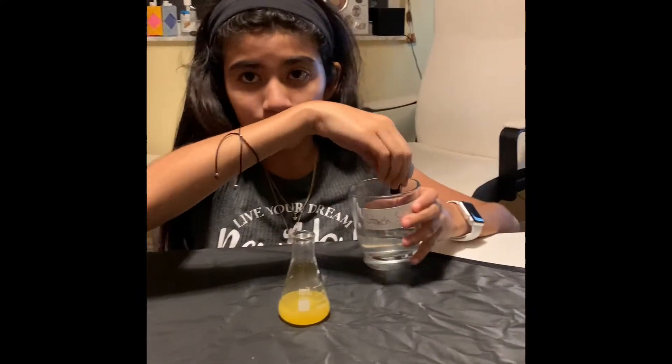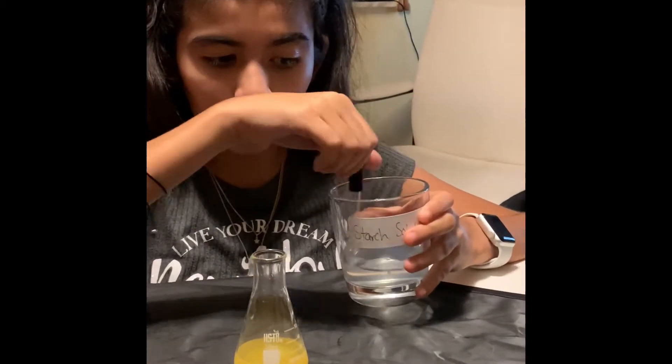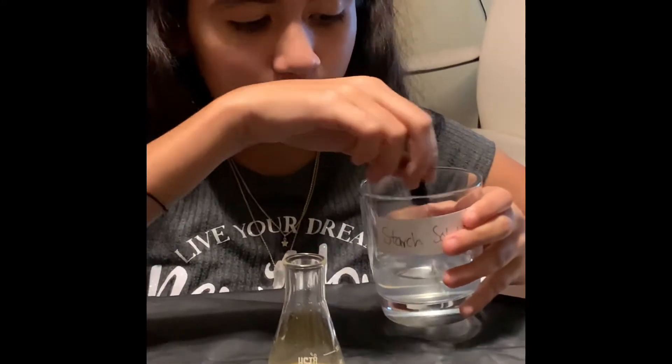But first, we need to mix it, just to make sure that the starch solution gets everywhere in the water. And I am not adding too much water or too much starch solution.